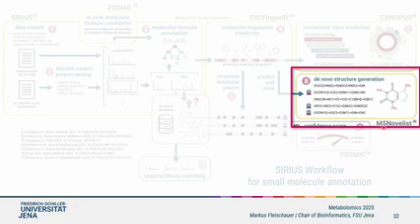And this is like MSNovelist, which is a generative model that basically, given the fingerprint again, can generate novel structures. They must not be novel, right? So it will also generate structures that are in the database, because if this is the correct structure, it makes sense to generate it.